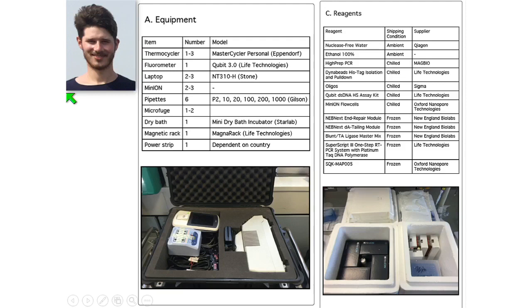He went to Guinea, but before he could go, he had to figure out exactly what you'd need to do to make the MinION into a portable device that would be effective at sequencing Ebola. So we'd already done some practice on some Ebola material that we'd got in collaboration with our local defense organization, DSTL, in Porton Down. And what he did effectively is he tried to set up a portable laboratory that would have all of the equipment that he needed. So he kind of cleared down a bench in the lab, and he got all of the equipment in order to do the protocol.